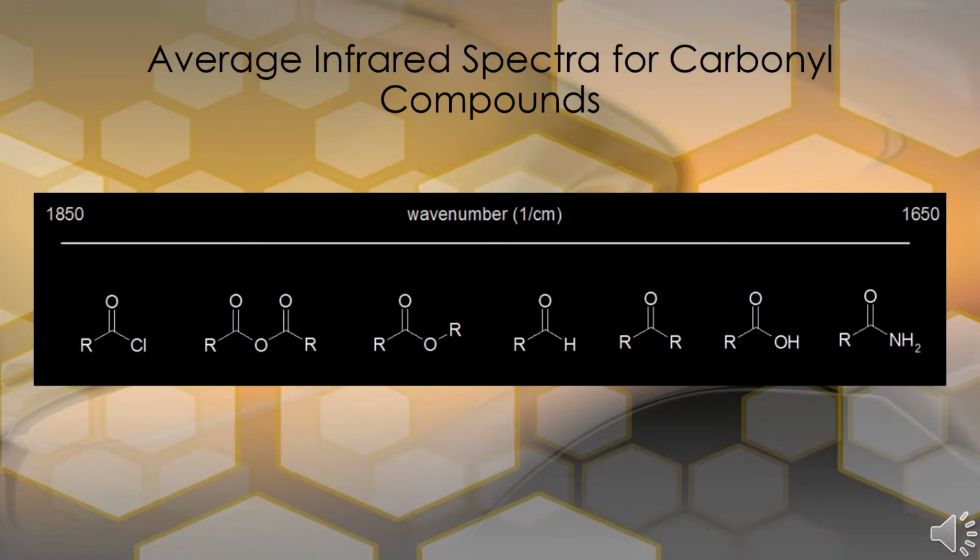Next, we will have a ketone, which has two alkyl groups, which is going to weaken our carbonyl even more because they are electron donating. And so with a weaker carbonyl group, it's going to take our wave number down. And so the spectra on the wavelength spectrum is going to go even further down than from the aldehyde.